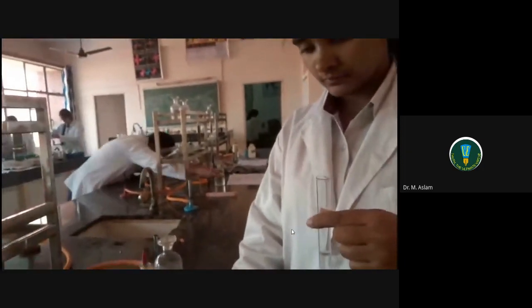For the brown ring test, you require a fresh test tube. You can use OS to begin with. For the OS, she's again preparing salt plus water to give you the OS. This is her OS ready. Roughly around 1 to 2 ml of OS is good enough. To this OS, you will need to add almost the same amount of freshly prepared ferrous sulfate. Mind you, freshly prepared, because ferrous salts quickly transform into ferric by aerial oxidation. So you always require the ferrous sulfate to be fresh.